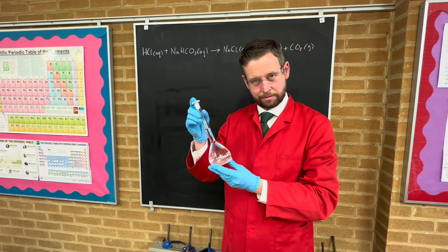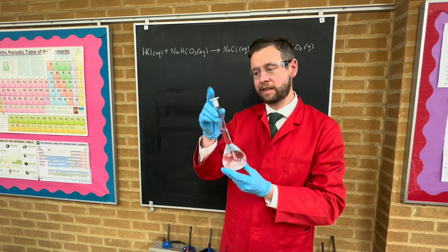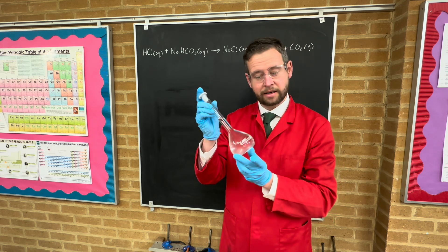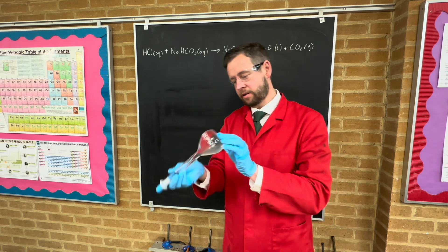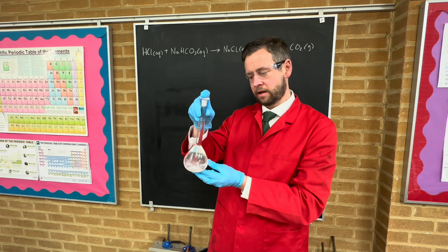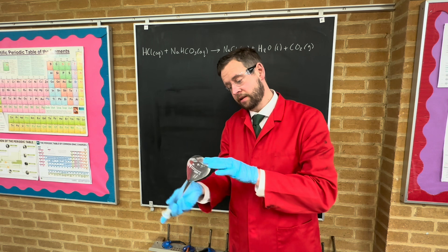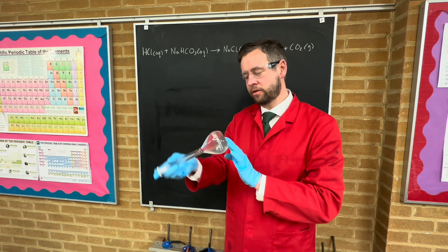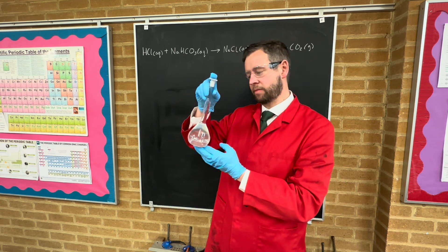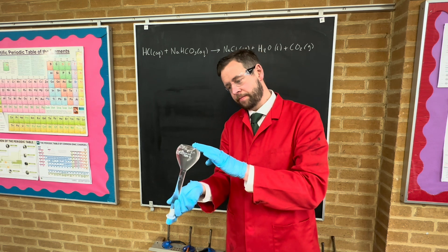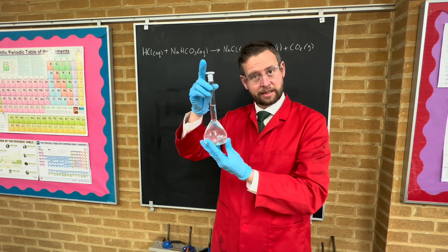With our standard we now need to do everyone's favorite: making sure that the lid is on, holding a finger on the lid, holding a finger on the base, let it invert about four times to allow uniform mixing throughout and to allow any remaining undissolved pieces to totally dissolve. And there we have it. This is our standard solution.